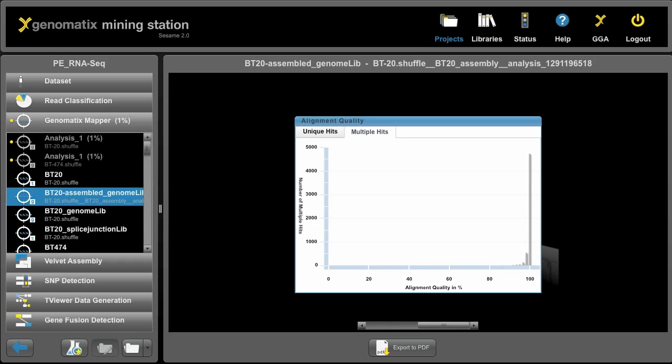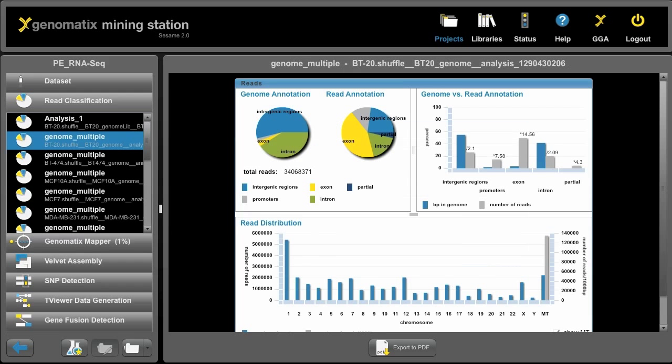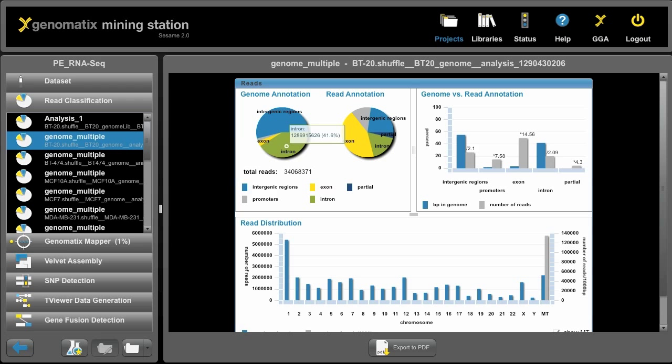We can also look at other analyses that you can run downstream, for example the read classification. Here we have the genomic distribution of different annotations like exons, and here we see how much they are enriched in the RNA sequencing dataset.